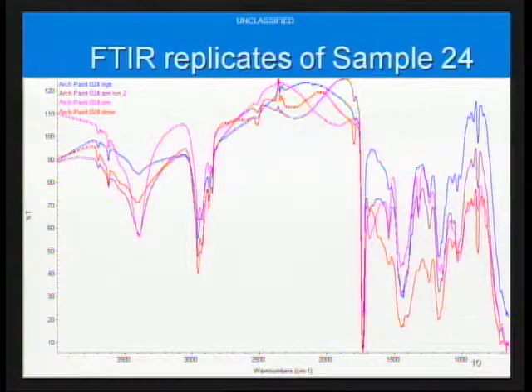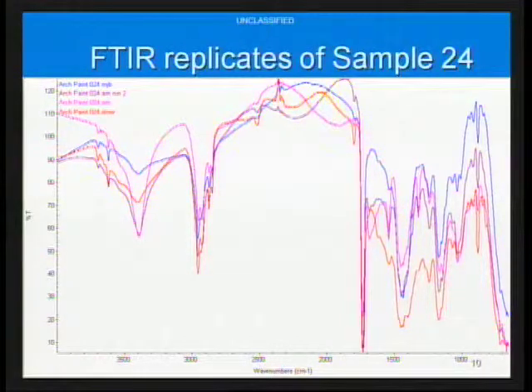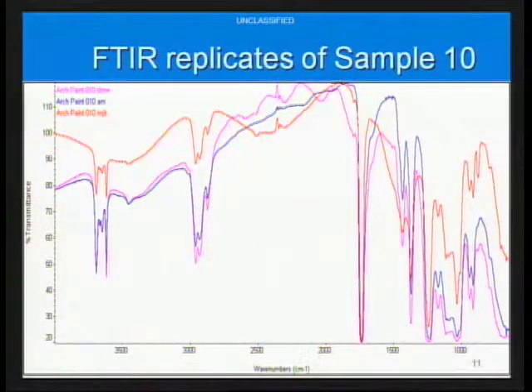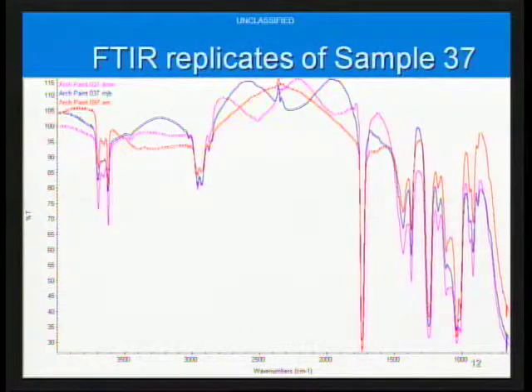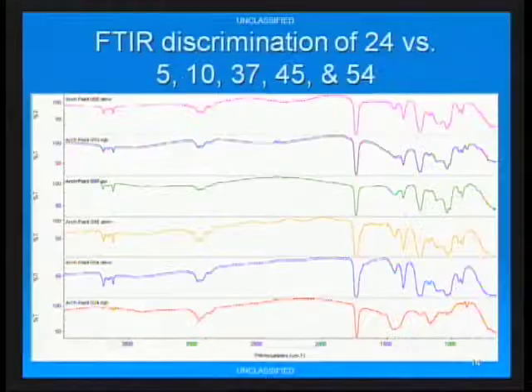Here I'm showing replicates of one particular sample — you can see some variation, likely due to sample prep and over absorbance, where someone put too much sample in the diamond cell. Here's another sample; again there's a bit of over absorbance in the kaolin region, but these are all replicate analyses of one sample. And here's a comparison of those last two — there may be some subtle differences in certain areas, but nothing we're going to call as discriminating at this stage.